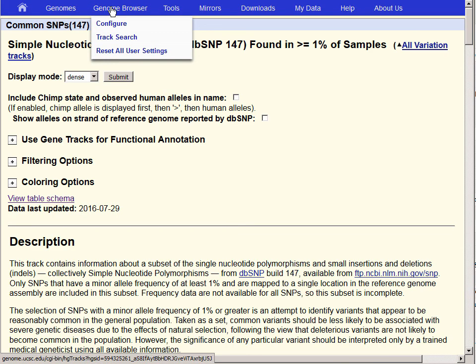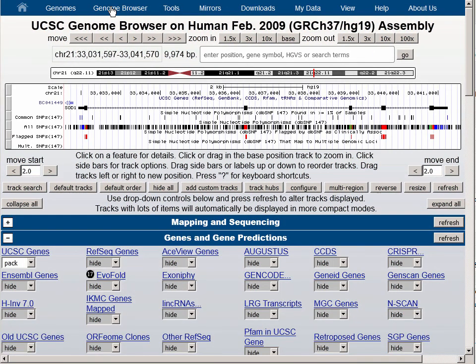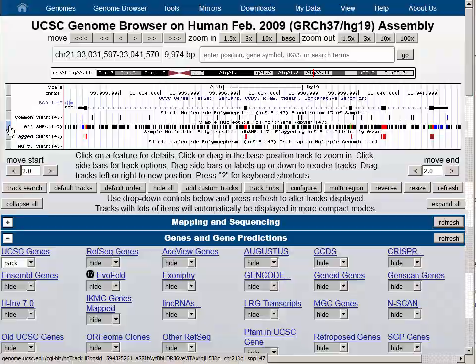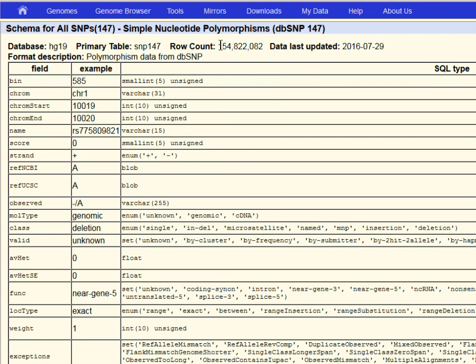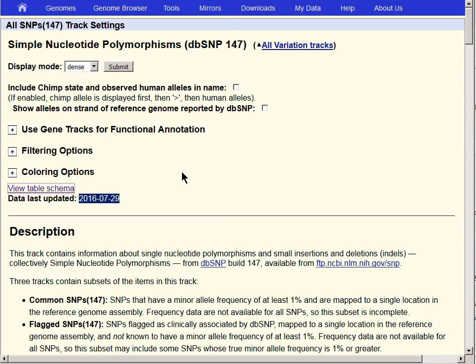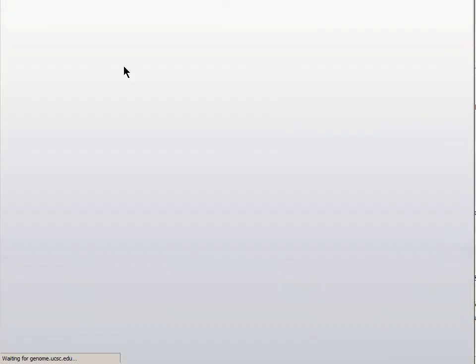We now go to the Genome Browser using the link in the top blue bar, and remembering that there were nearly 15 million SNPs in the common SNPs track, let's look at the All SNPs track. Clicking into the table schema, you will see that this table has more than 154 million SNPs — more than 10 times as many as the common SNPs table. In the full dbSNP dataset, common SNPs are much less common than rare SNPs.